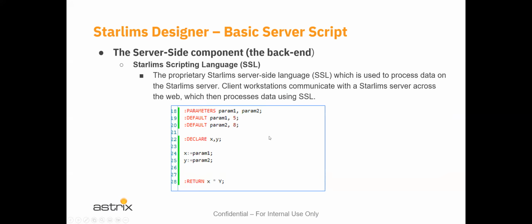STARLIMS is a loosely typed language. You don't have to define a specific type of data type for a variable. It is presumed or assumed by the system based on the value that is being assigned. So we know that param1 will be a numeric value.